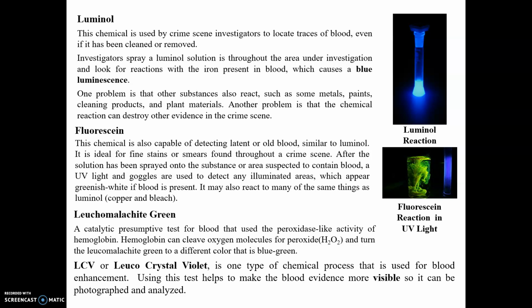And then the other one is going to be LCV, or leucocrystal violet. It is a chemical process that's used for blood enhancement. So this would be kind of like your physical developer when we were talking about fingerprints, right? So typically, just like physical developer, it is always the last thing that you want to try and use. But using this test can make blood evidence more visible, so you can actually photograph it and do some analysis.